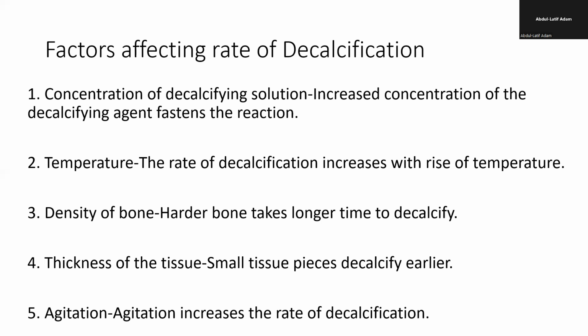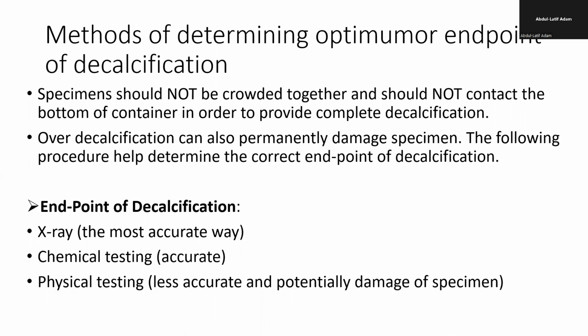And comes out. Otherwise, there is no agitation. It means that the ones that will go in are the ones that will stay inside the tissue, and then it will become saturated and the tissue will not be decalcified. But as you agitate it, it creates a current that allows the fluid to enter the tissue, come out of the tissue, fresh one entering, then coming out and entering, and then it enhances complete decalcification. Okay.